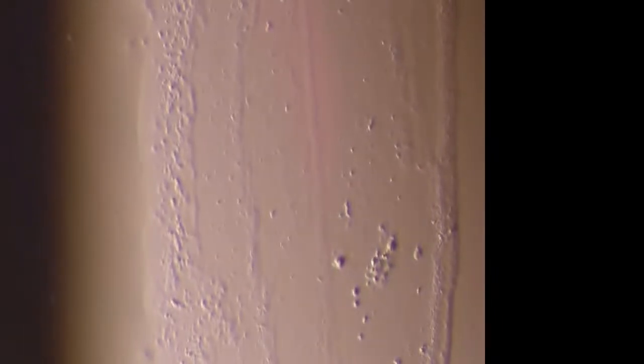All right, well, we've seen enough of that waterfront. Let's go look at something else. You can see all this debris has created these kind of dry debris fields as the water's receded. Like when you get a puddle on the ground, you get those different rainbow colors as the different solutes in the water have deposited out. But it looks solid here and plain because I have it in oblique lighting view.